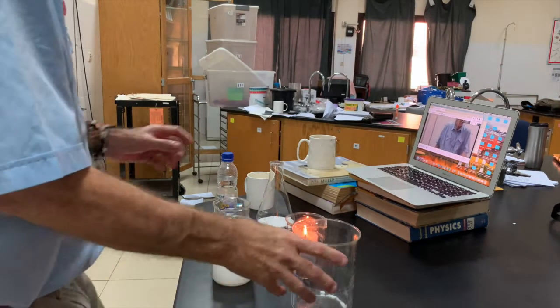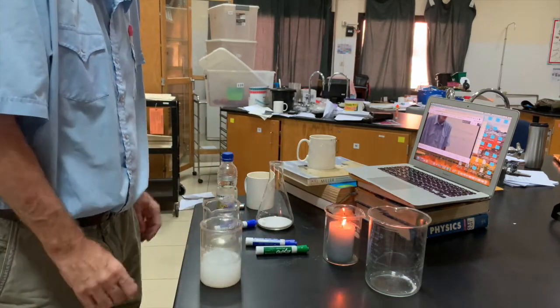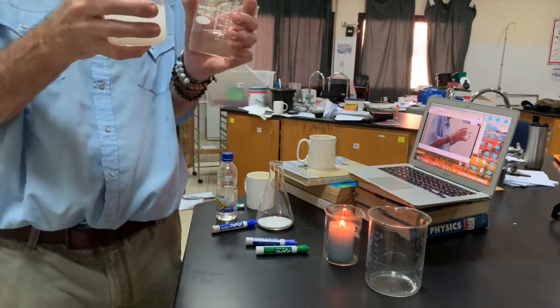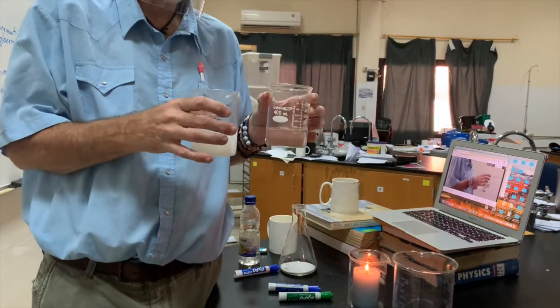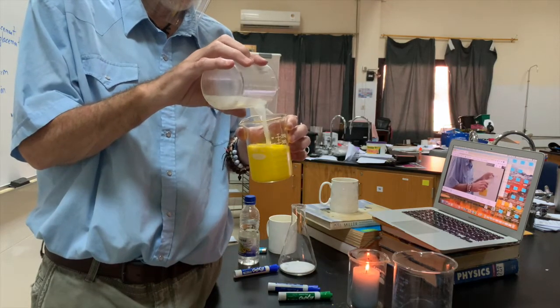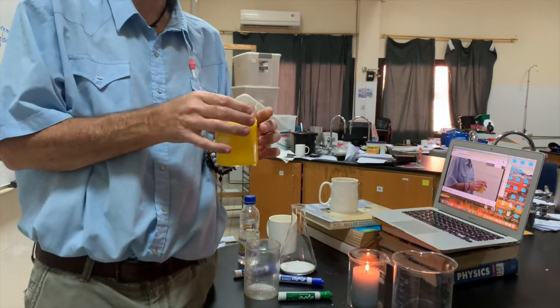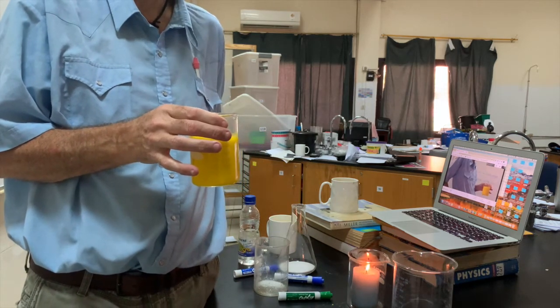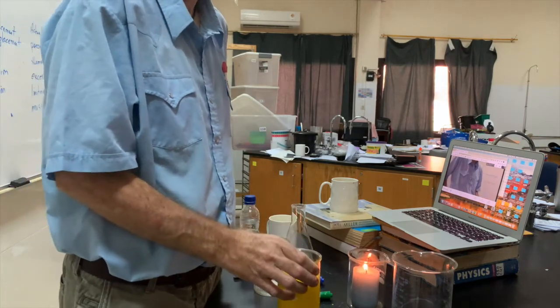All right, so this is the first experiment. So I'm going to take these and I'll just mix them. Are you ready? Yes. Sodium iodide, and lead 2 nitrate. Cool, huh? So, what color do you think the lead iodide is? Just guess, wild guess. Yellow. Yeah, yellow, it is.